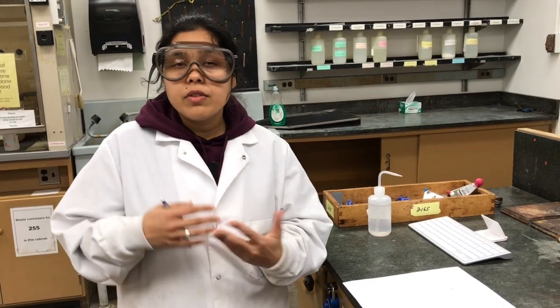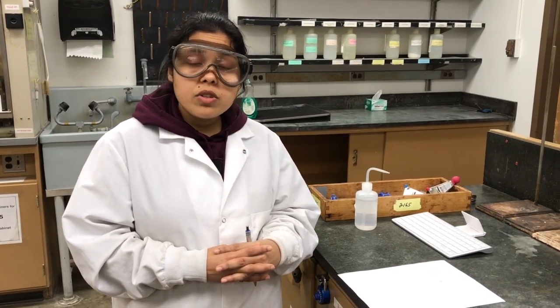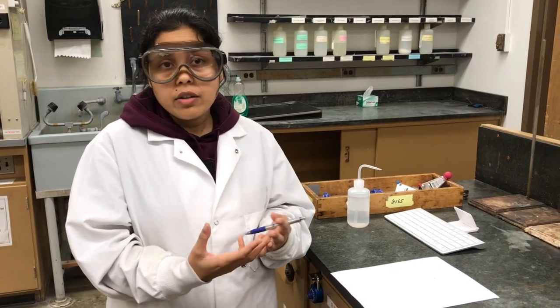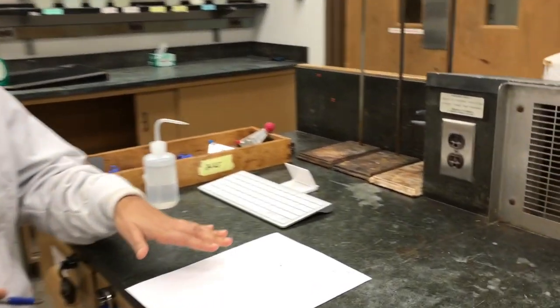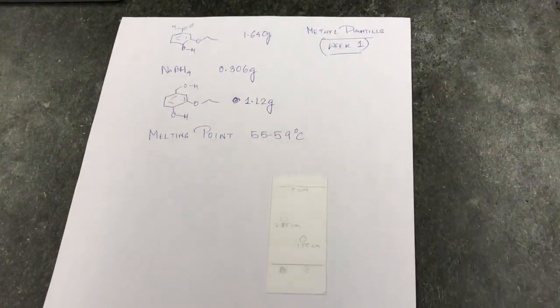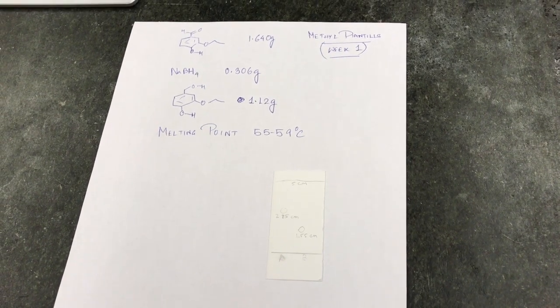As I showed previously from the vacuum filtration setup, while we were going through all this filtration, we obtained white solids, very powdery, our ethyl vanillin alcohol, and it's kind of wet. We took the melting point, and it is about 55 to 59 degrees C, which might be because it's still wet and has moisture in it.